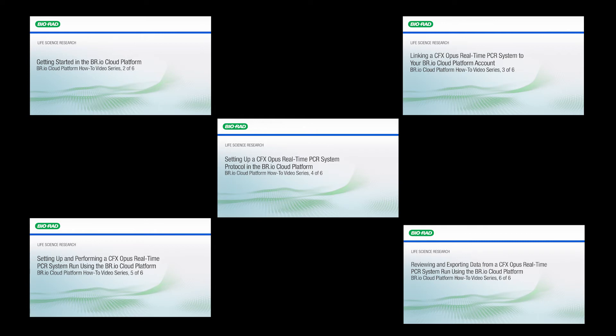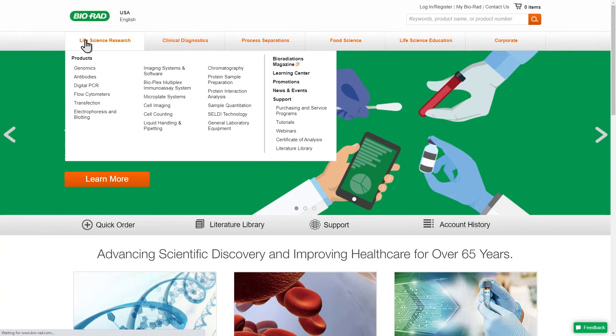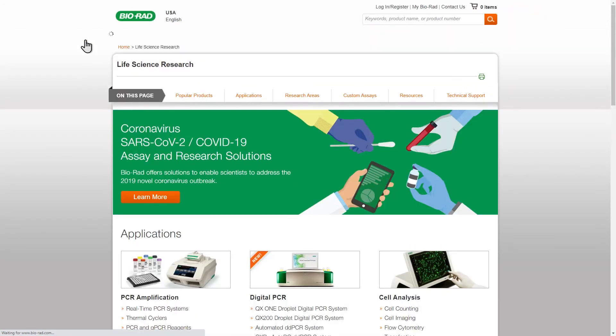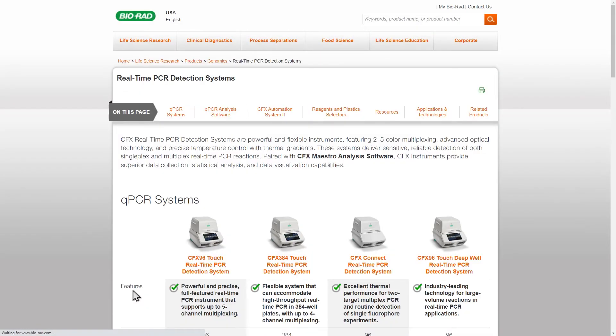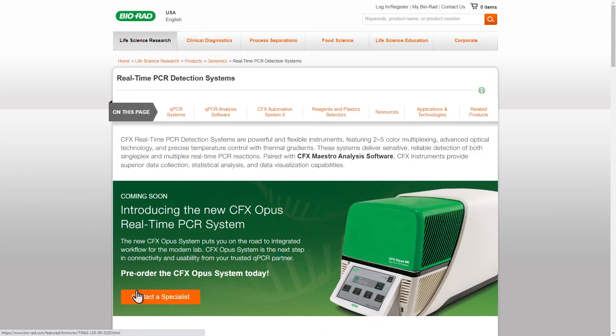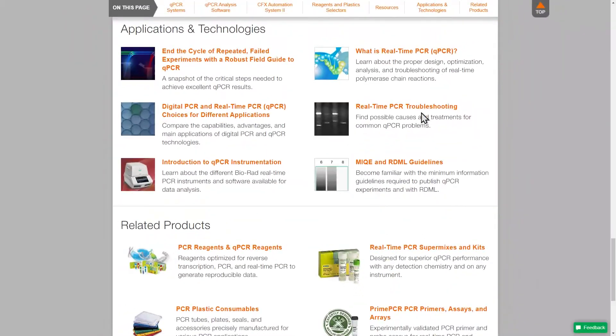This series is intended for researchers who are already familiar with real-time PCR and its applications. If you would like to learn more about real-time PCR, visit the Biorad website. You can find helpful information about real-time PCR in the Applications and Technologies section under Life Science Research.